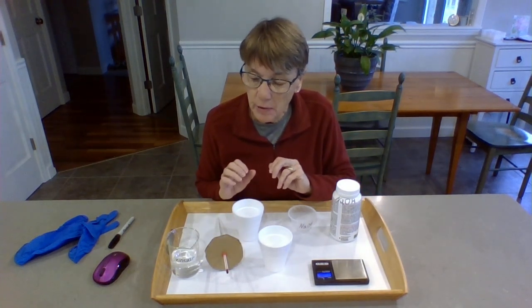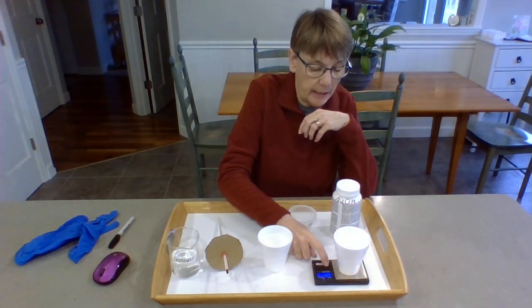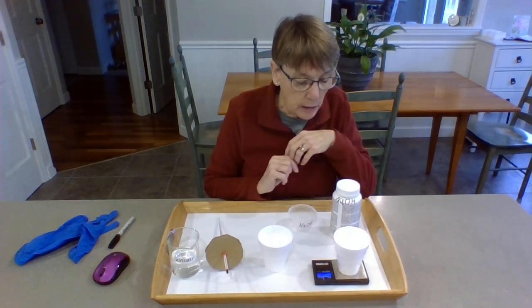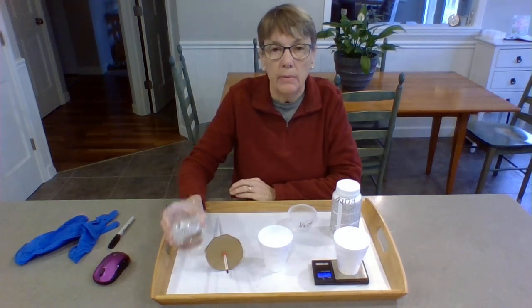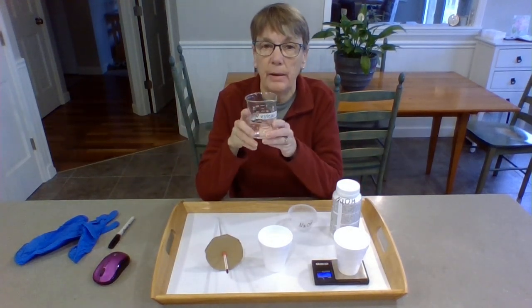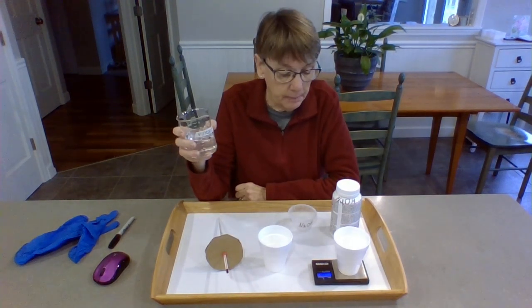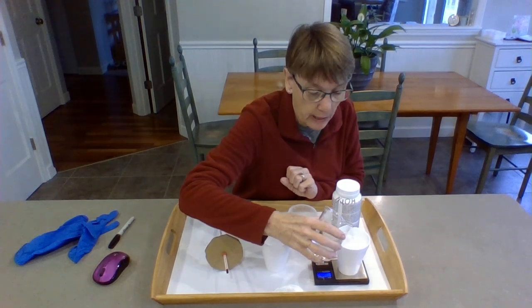Okay, so now I'm going to keep the cup on the scale, and I'm going to tare it again because what I want to do is weigh out my vinegar. This is my vinegar. I'm going to weigh out 115 to 125 grams. So I'm just going to do that.